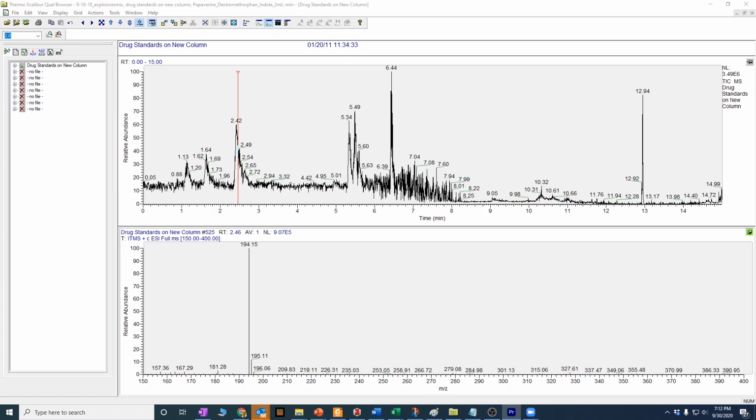What you want to know about mass spectrometers at this point is the kind of mass spectrometers that you hook up to the LC, in a technique that we'll call LCMS. Now, again, we learned in the vocabulary, don't get confused here. Nothing has changed. It's the same HPLC unit. It's just weird that we drop the HP; we don't call it HPLC-MS, we just say LCMS. It's the same unit, the same everything. But as soon as you hook up a mass spectrometer, we drop the HP for some reason. This is LCMS: LC with an MS detector.